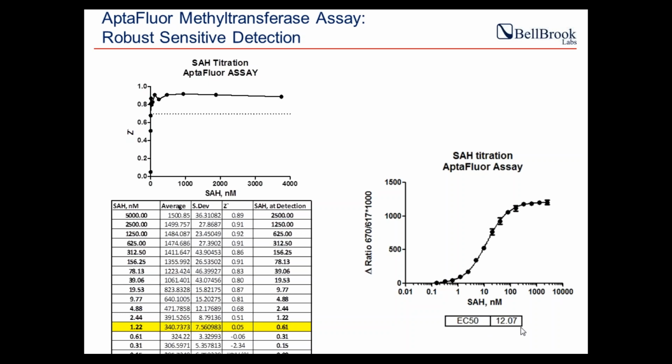Now, as I said, you have to pay attention to the most important part, which is the temperature. So if you want to get a very sensitive assay, I would say incubate the plate. I mean, you can run the enzyme reaction at whatever temperature you want, but cool down the plate to room temperature before adding the detection reagents. That's really important to get a very sensitive assay.